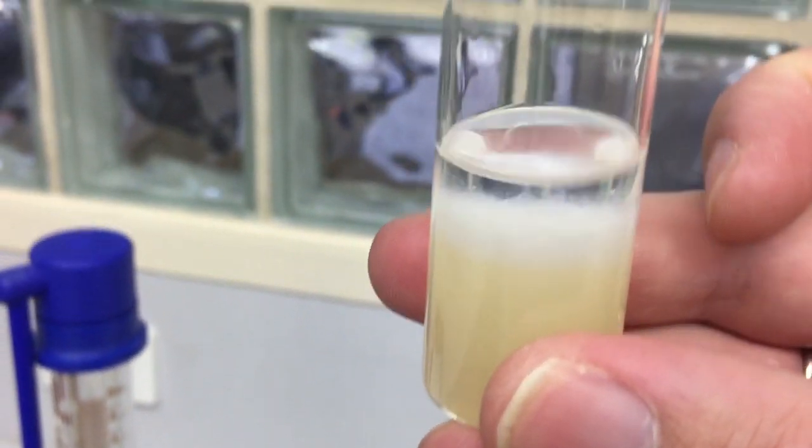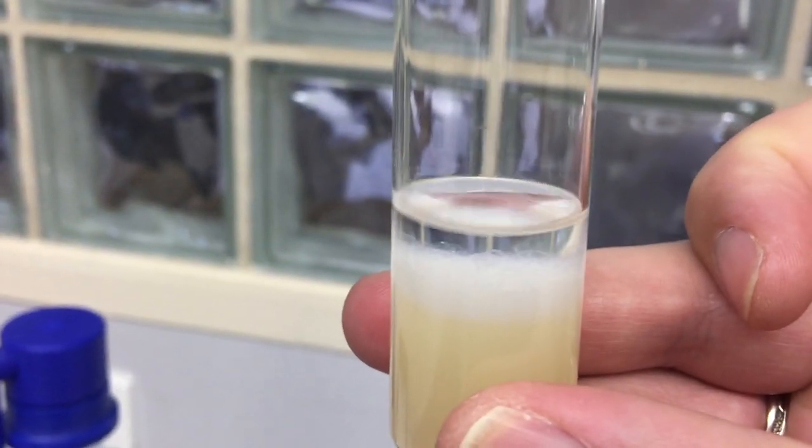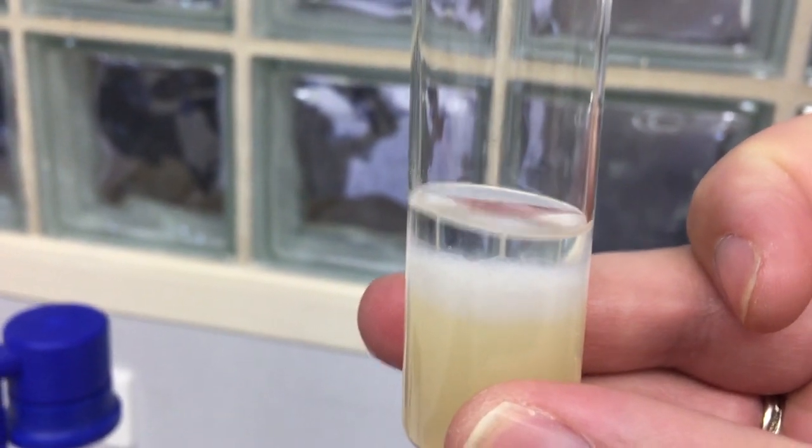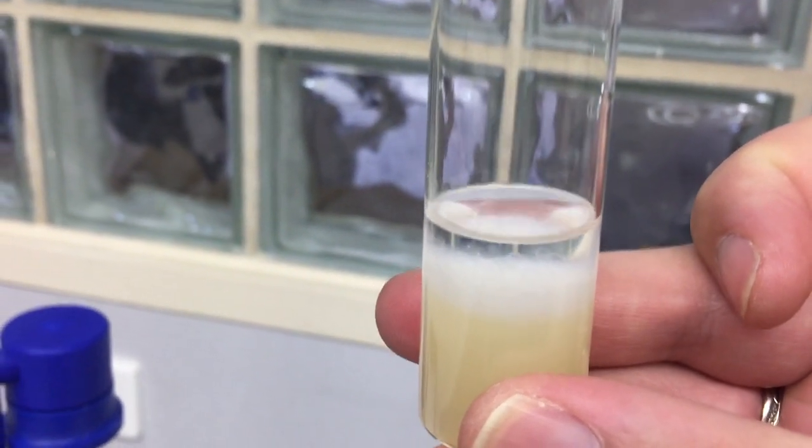And hopefully we will get some DNA precipitated at the boundary layer between the solution and the methylated spirits. And you can see a little bit just there, that kind of milky, filmy sort of layer, that is our wheat germ DNA precipitate.